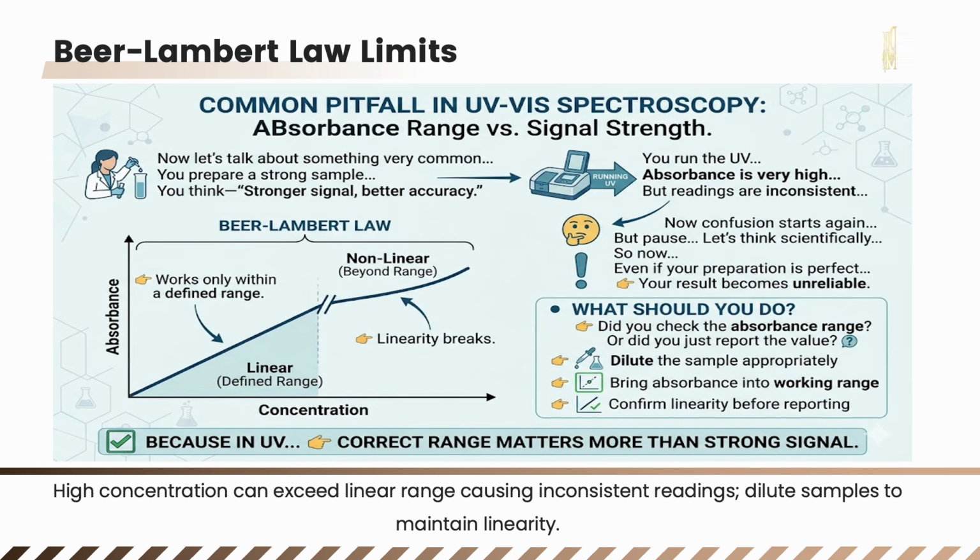So what should you do? Dilute the sample appropriately. Bring absorbance into working range. Confirm linearity before reporting, because in UV, correct range matters more than the strong signal.